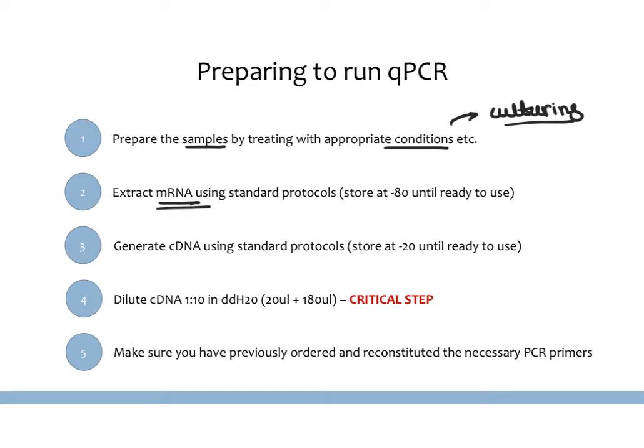And mRNA can be extracted using any standard protocol. There are many protocols, and it needs to be stored in the -80 until you are ready to use it. mRNA needs to be kept very, very cold if you're going to store it for a long amount of time, so do keep that in mind. And once you make it, you can store it for a very long time, and you can use that sample to keep regenerating cDNA and keep doing more and more assays. So it is useful to make your mRNA and store it well, so then you don't have to do this whole step again of making all the samples. And then this should be done, of course, in triplicate, as we said.